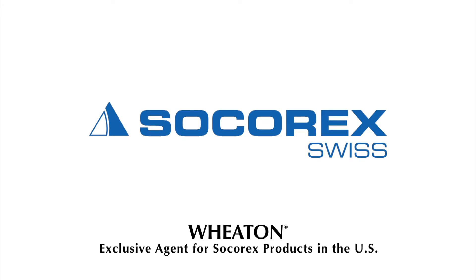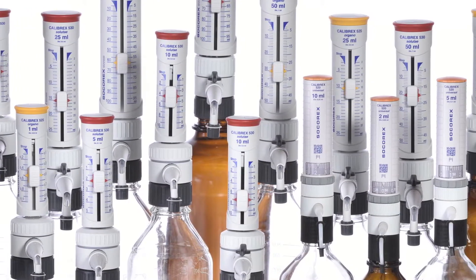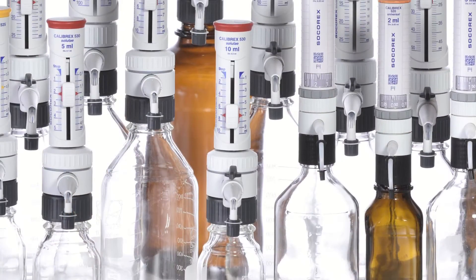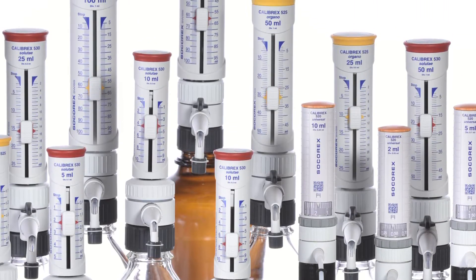Socorrex Calibrex Bottletop Dispensers. This dispenser line includes a large selection of robust dosing instruments intended for safe and reproducible liquid distribution in volumes ranging from 0.1 milliliters to 100 milliliters.